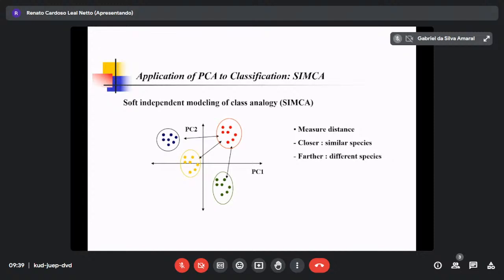Now you have 45 species, yeah. Alves, you also say you have 100 species. You measured LCMS and NMR. So first, your idea is you want to classify, right? Which species are close to which one? Which species is clear? Then after PCA reduction, with the original data you can do a phylogenetic tree, and see which species are close.